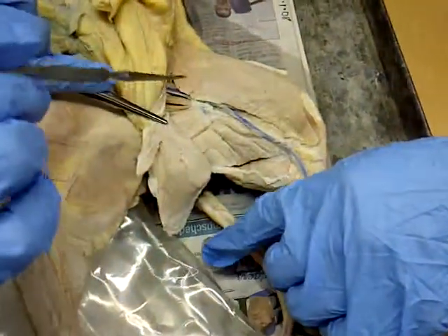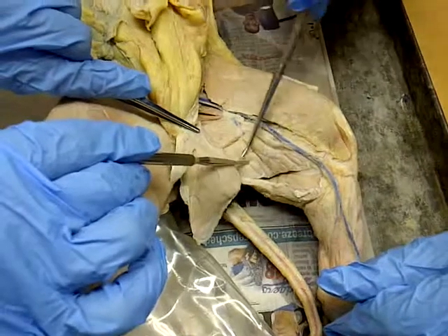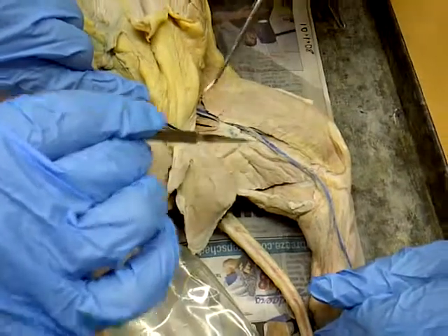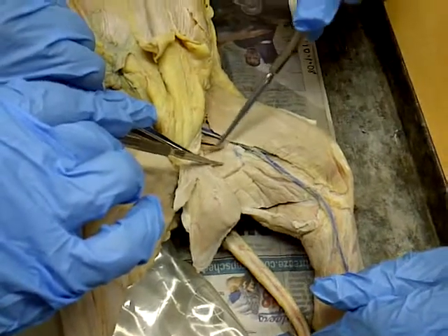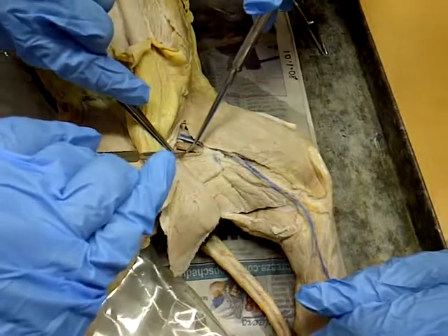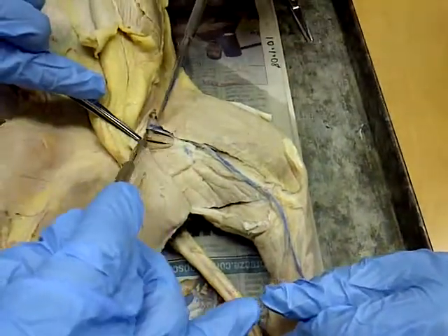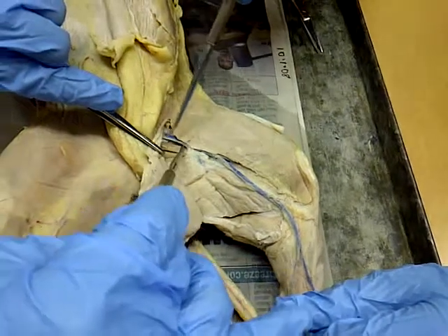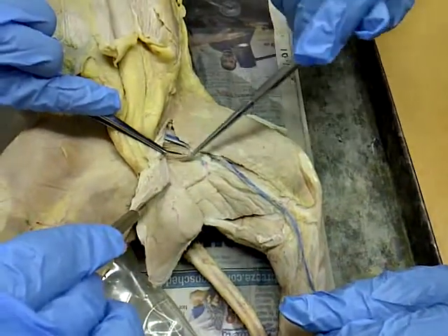Can we do those three again? Okay, semitendinosus, semimembranosus, and the adductor. Adductor, as in adding. Adductor femoris, and there are two heads on this. See this section right here that looks like it's not part of it? This is part of the adductor femoris. And this long section right here is the adductor longus. Don't confuse the adductor longus with this part that is part of the adductor femoris.